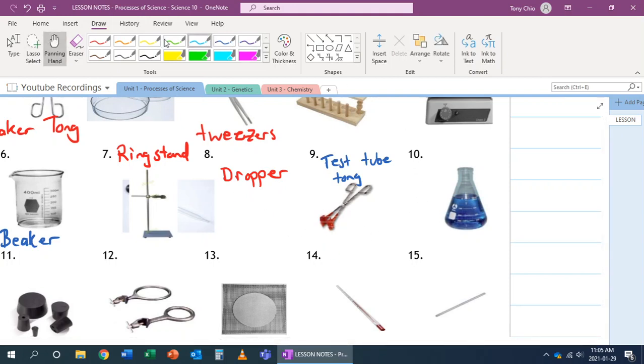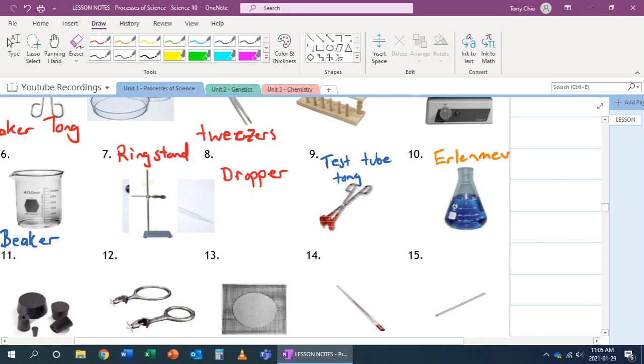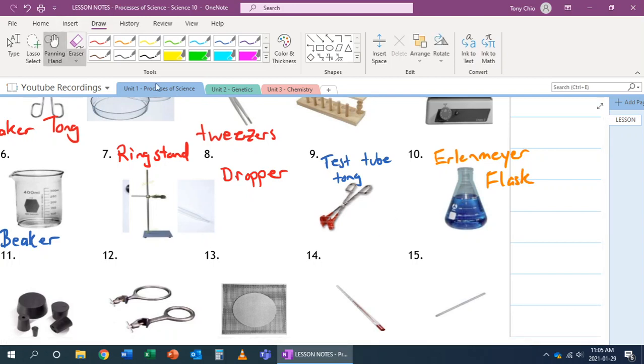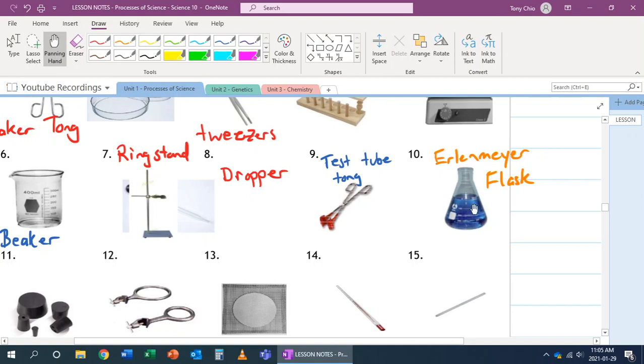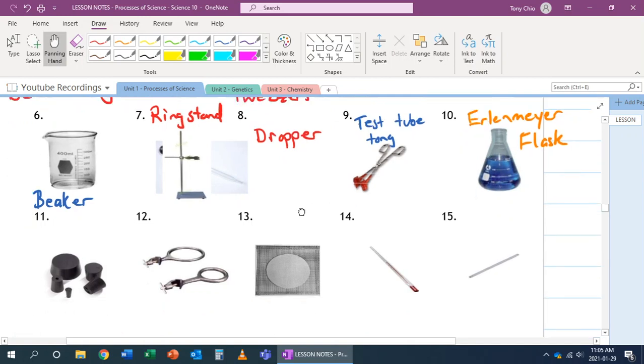Number 10 has a longer name. It is called an Erlenmeyer flask. And this one allows you to mix solutions really well, as well as because the top is much smaller than a beaker, you can put a stopper on it to now store solutions as well.